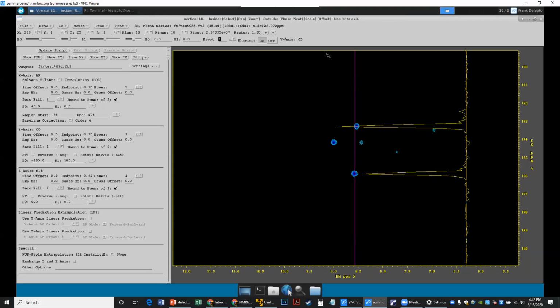But then why did you choose your pivot to be upfield, somewhere around 180, in the demo? That's a great question. Putting the pivot in the center will only let you phase correct the spectrum if there's no additional phase correction beyond what's caused by the initial delay. I see. Okay. Great. Thank you. That is very important.